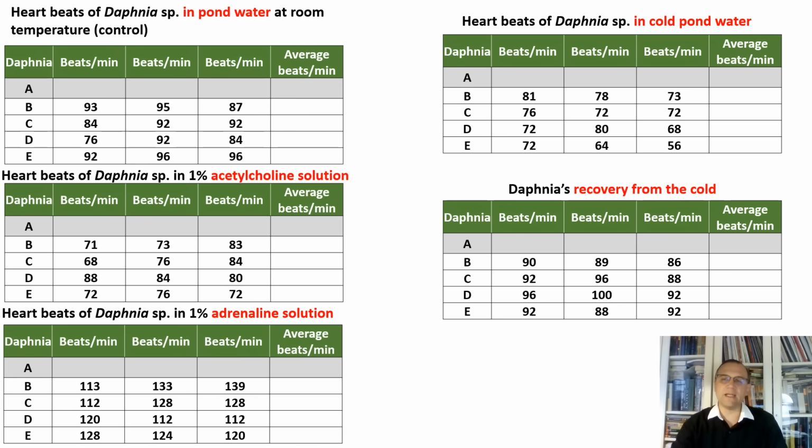I give you a tip. To find the cheating group, you will have to do simple calculations. Think of how you found heartbeats per minute. After you have identified the group, you will have to explain on paper how you found this falsification. Attach these findings and explanation to your lab report.